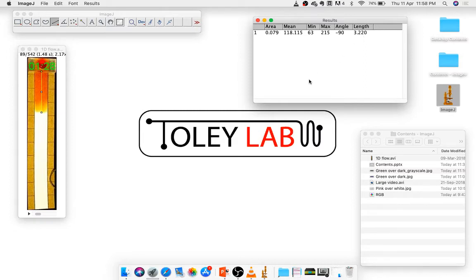In many cases, you might not know the scale early on, so you can do the analysis in pixels. It really depends on what you're looking for. But having any dimension in this image that's known to you is a very good way of setting the scale. Once the scale is set, and as long as this image is open, the scale will always remain set.